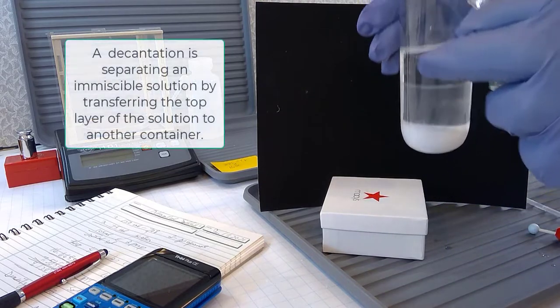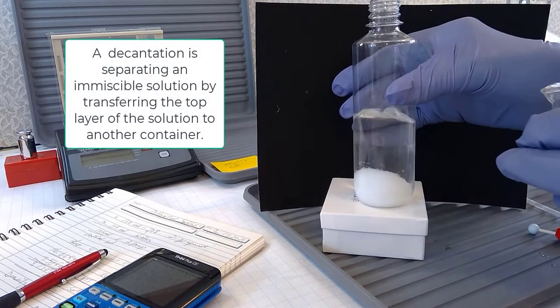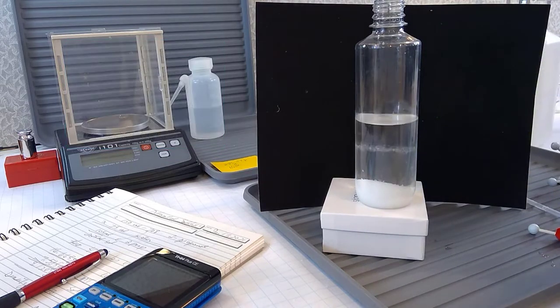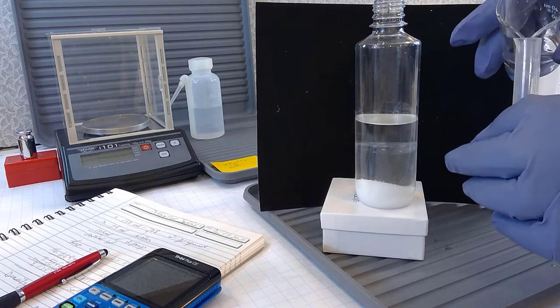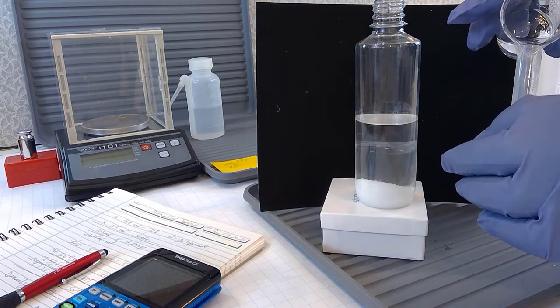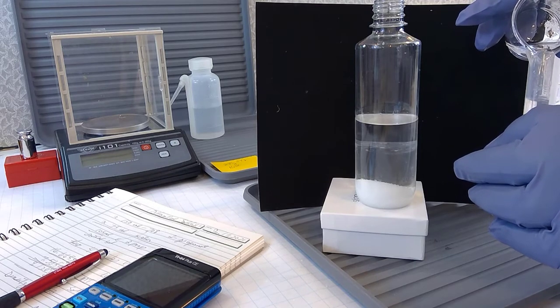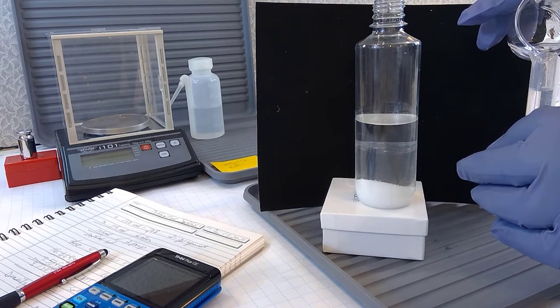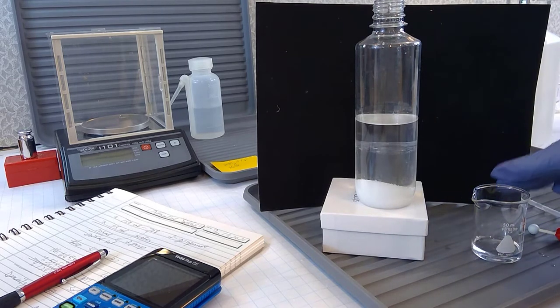Yeah, it's separated. So I can get just a little bit more of my isopropanol salted out. It's a good term, salted out. It's been pushed out by the salt, and I'll see if I can get 10 mLs on the money. I can do it drop by drop, and yes, level. And let's see what this weighs.